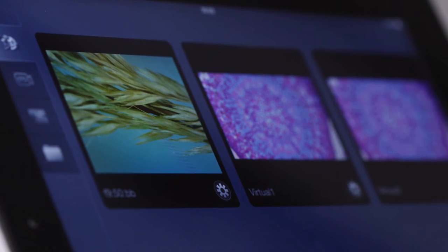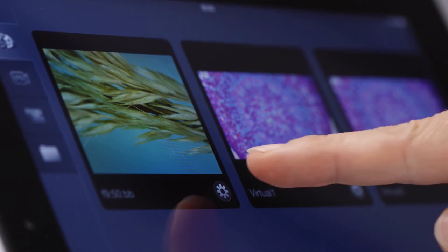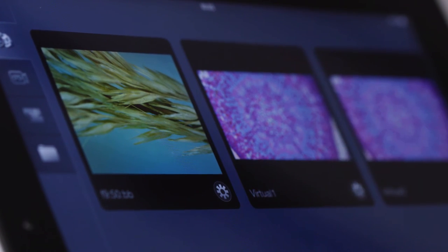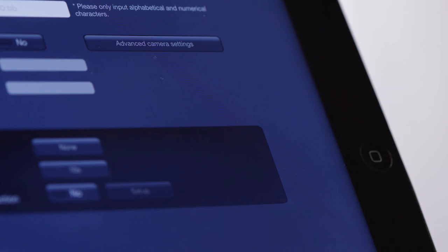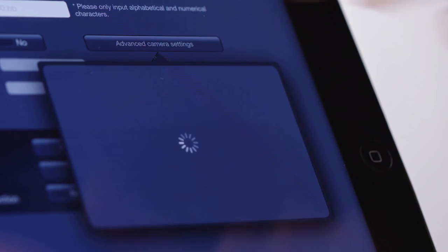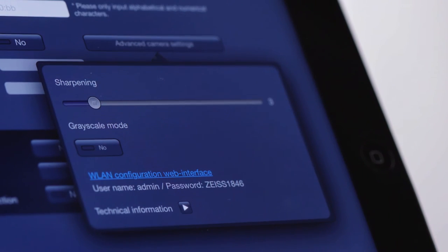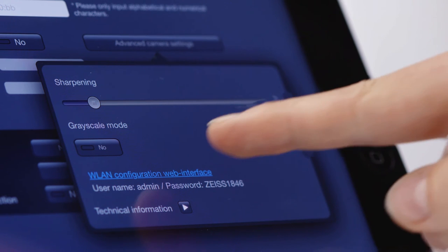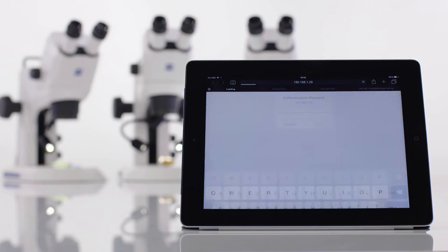Set up a digital classroom. To change the microscope's configuration, tap the gear beneath the system you wish to edit. Then go into Advanced Camera Settings and open the link to the microscope's Wi-Fi configuration web interface.